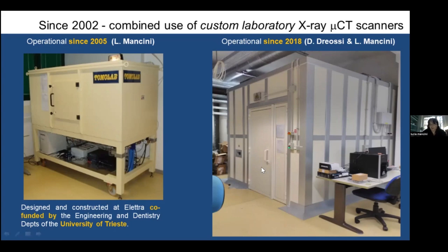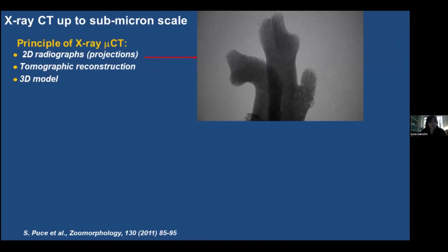That is really the purpose of this series of webinars: to determine the best conditions, or the best parameters, for an experiment using synchrotron radiation, where typically you have a very short time, sometimes a unique possibility to perform your experiment. So the use of these facilities allows you to prepare this experiment well. But they are also interesting in themselves for many types of measurements and analysis. We will see some examples.